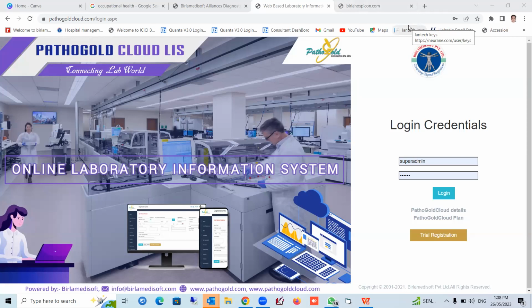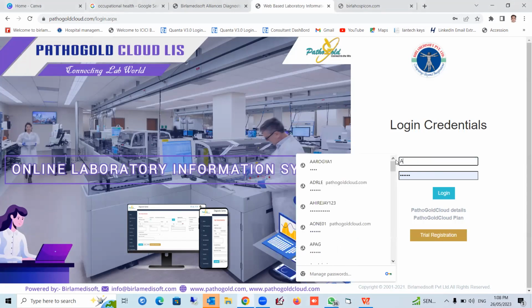Today we are going to learn something very important in PathoGoldCloud. We are going to see how we can introduce a new test very easily, and how you can deselect a test given by the company, which already comes in PathoGoldCloud, and introduce your new test. So this is the video. Please watch carefully. I will show you each and everything in this video. So let's log into the system.